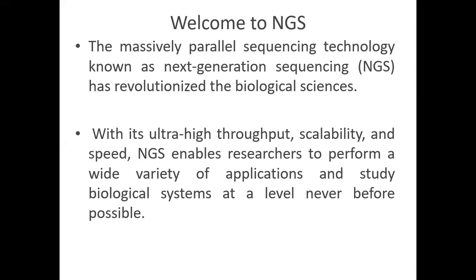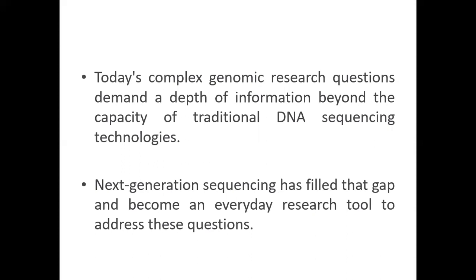So most researchers are able to do a wide variety of applications with NGS, and they study the biological system at different levels, which has never been possible. By now, NGS is a good technology that we use for such purposes.